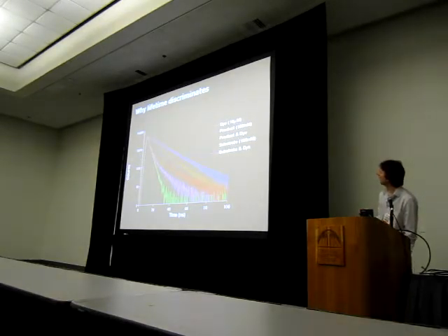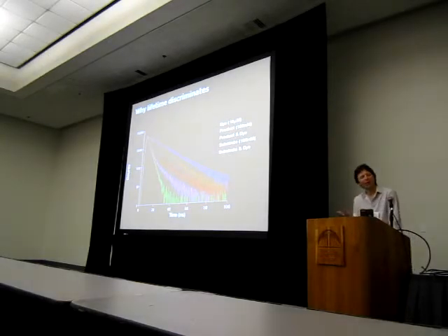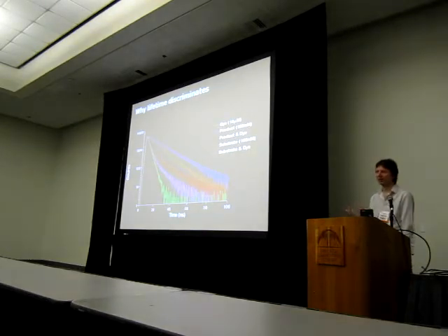And then we have the interfering dye compound, which we chose. We thought to ourselves, well, what would be the worst possible interfering compound that you could come across in a screen, or if you wanted to measure its dose response? Well, in fact, looking at the fluorescence characteristics of our PURETIME 14 dye, the absolutely worst one would be coumarin, which excites exactly the same wavelengths as our PURETIME dye and emits exactly the same wavelength. Happily, it has a very much shorter fluorescence lifetime. And you can see that by the steepness of the slope of that green line that you have there.